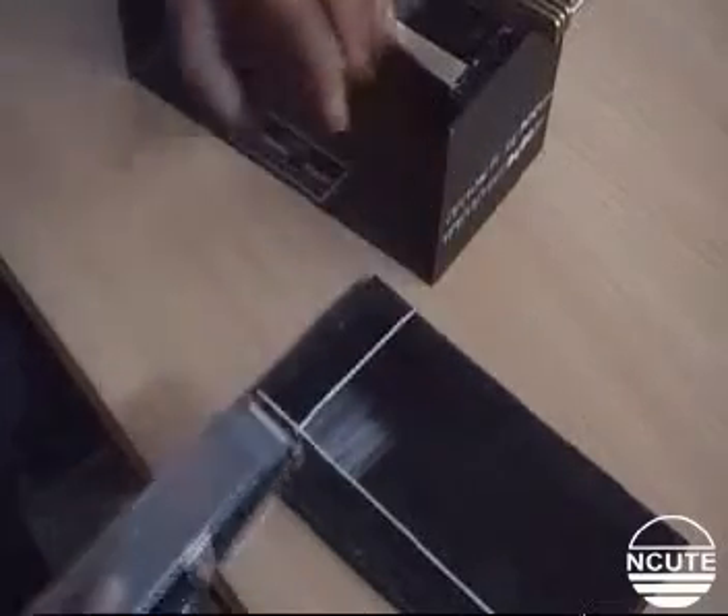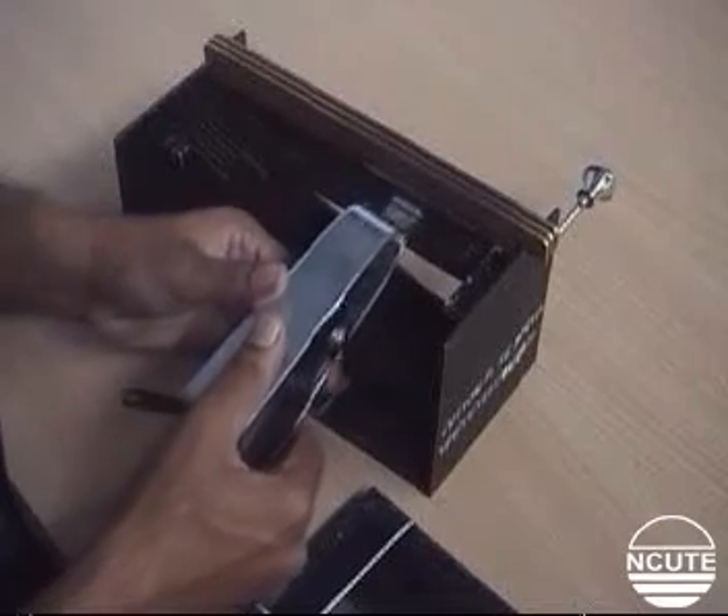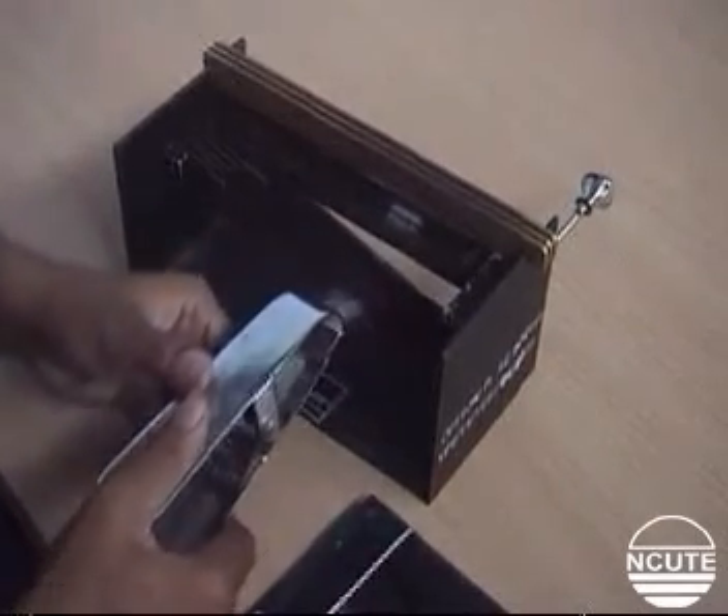Repeat this operation dropping comb after comb until all the fibers have been transferred to the pad such that a uniformly dense array of fibers is formed.